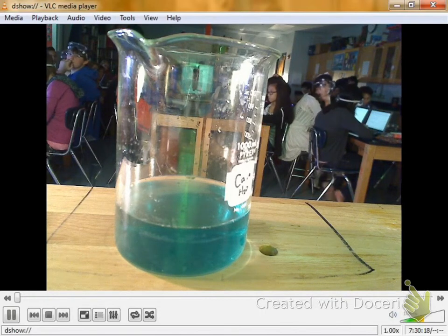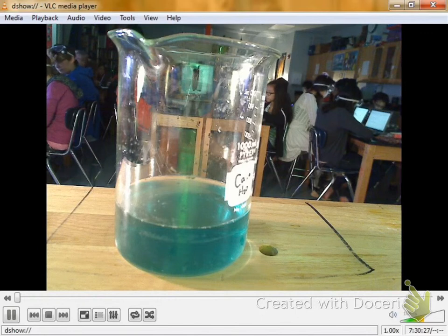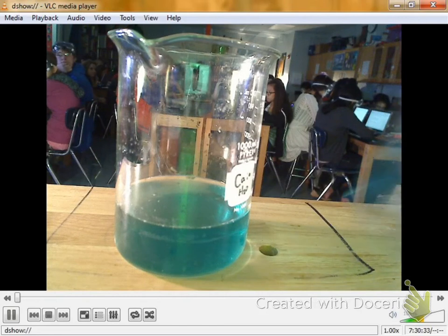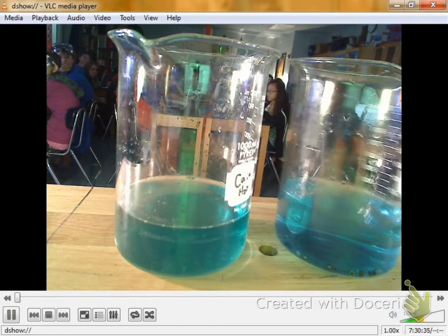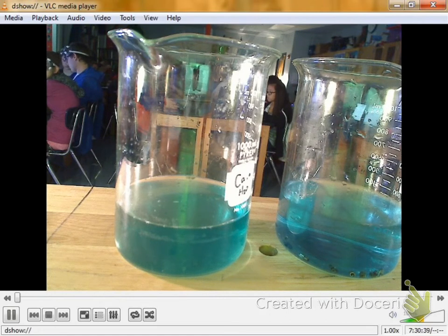Alright, anything happening to the color of the water as that calcium is bouncing around in there? I say it's not looking as blue anymore, is it? Yeah, it's kind of turning more, because remember, here's the color blue we started out with. Oh yeah, it's definitely more green. It's like a turquoise. Yeah, it's greeny. It's kind of getting greener and greener and greener, isn't it?